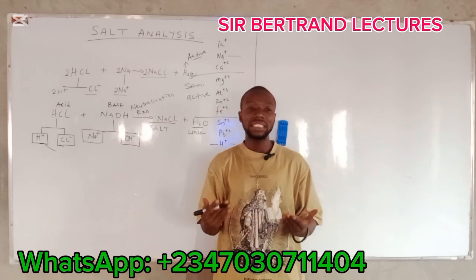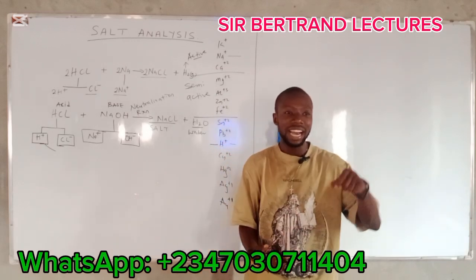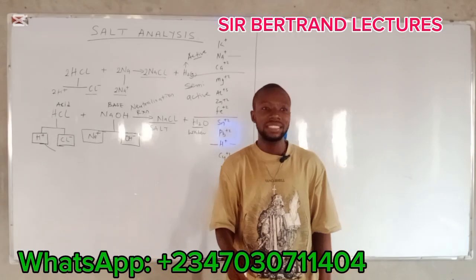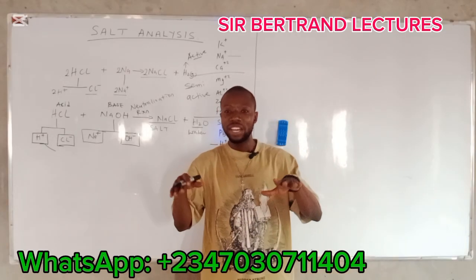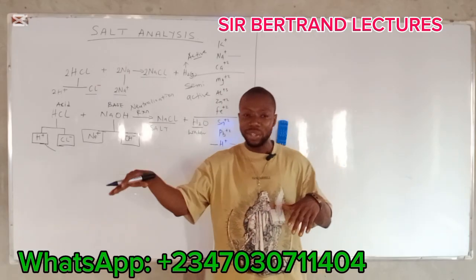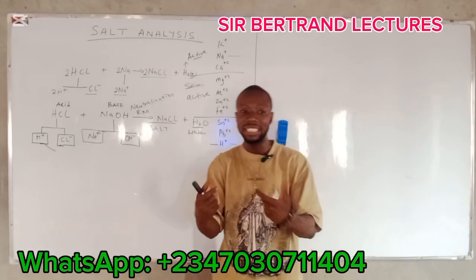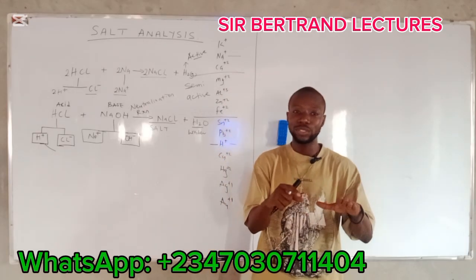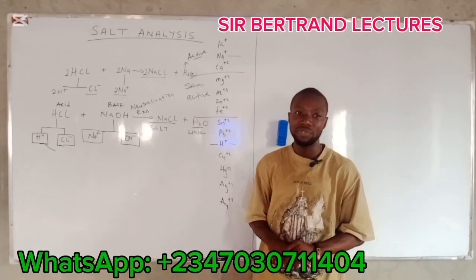The practical experiments or procedures that indicate the ions that are present in a given salt sample, and by doing so, after you must have known the positive and negative ions that are present in a given salt sample, you can from there dictate the name of the salt sample given to you. Now, let's dive in.